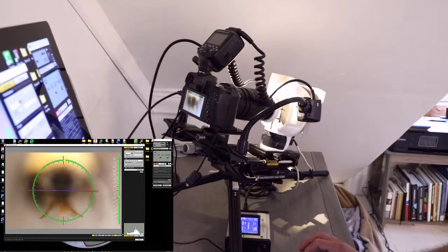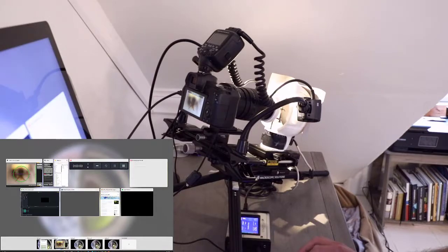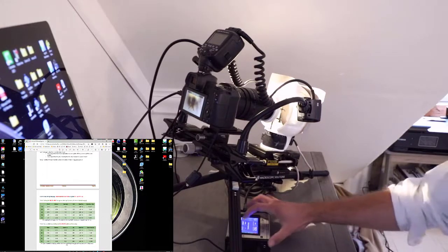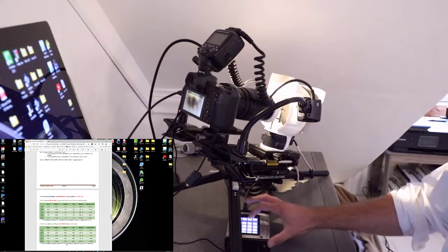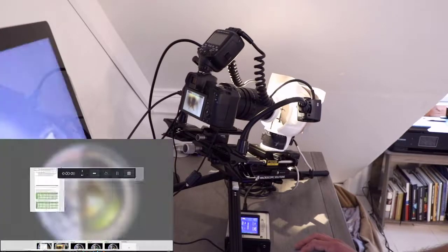Also, it's important to note that we are at 3x magnification. So what I'm going to do is just take a look at my other desktop here at 3x magnification. These are the ideal camera settings we have figured out for you. But the step size will be 0.08 millimeters. So we're going to go ahead and enter that into our stack shot now. That means that every time a photograph is taken, it's going to travel 80 microns relative to the next photograph. That's the depth of the area that's in focus.